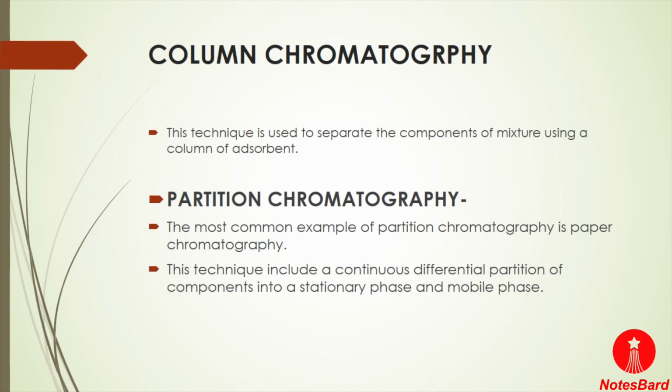So these are the different types of chromatography. Besides this, there are different chromatography methods also used in the industrial field and in other fields, named planar chromatography, thin layer chromatography, ion exchange chromatography, gas chromatography, liquid chromatography, and many others.